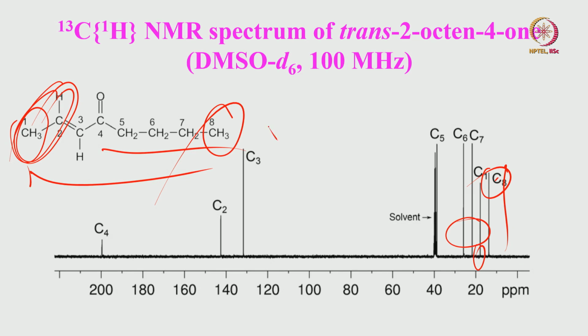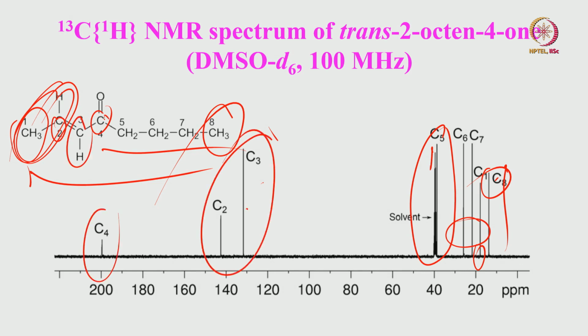And of course, you come to the solvent. This is the solvent which is used. One solvent peak is here, in addition to this 3. And if you come here, there are 3 quaternary carbons here, I think. No, that's C4, C2 and C3. C4, C2 is this one, and C3. Okay, C2 and C3 are CHs, and C4 is quaternary. Quaternary is very weak in intensity.